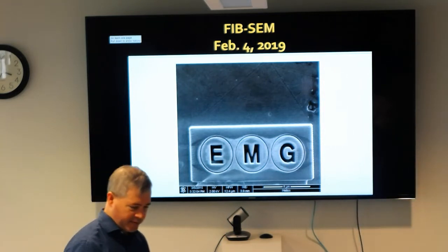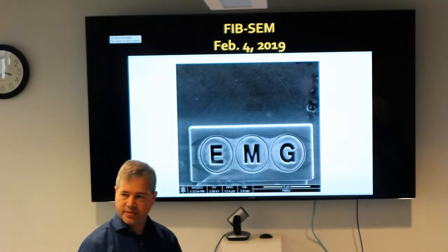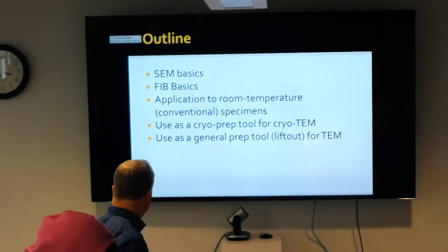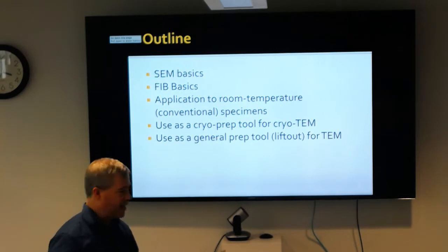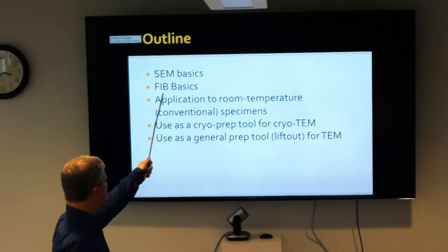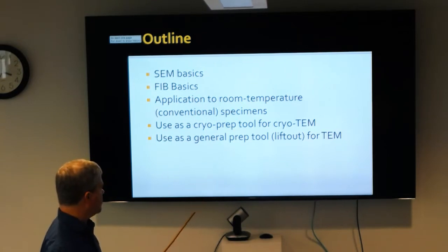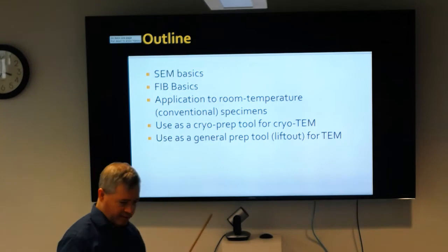So yeah, I'll talk about the FIB-SEM today: what it's used for, its basic principles, and all that. For the outline, I'll give some SEM basics, because the course up until now has been all TEM, so SEM is quite a bit different. Then basics on the focused ion beam, application to room temperature, or what I call conventional specimens, then using it as a cryo prep tool for cryo-TEM, and as a general prep tool, lift-out for TEM.